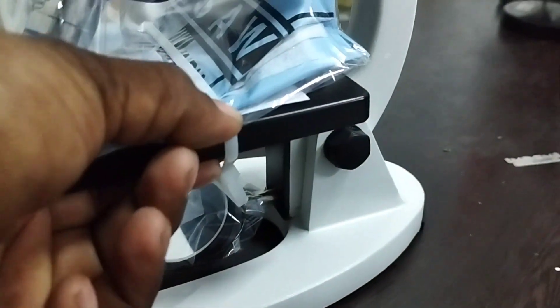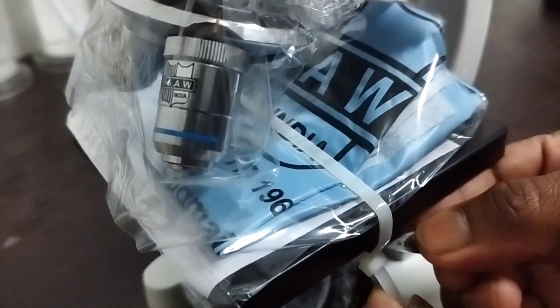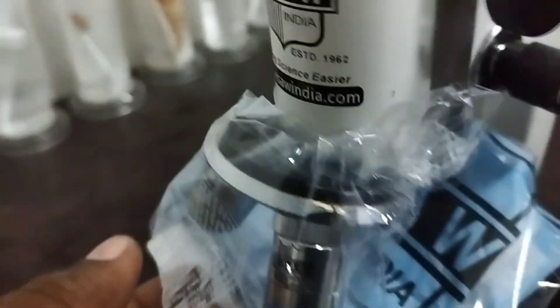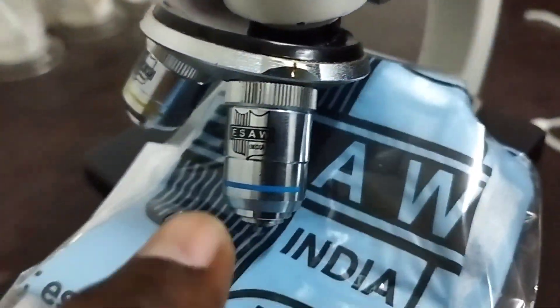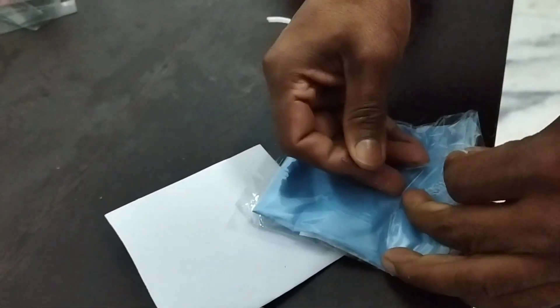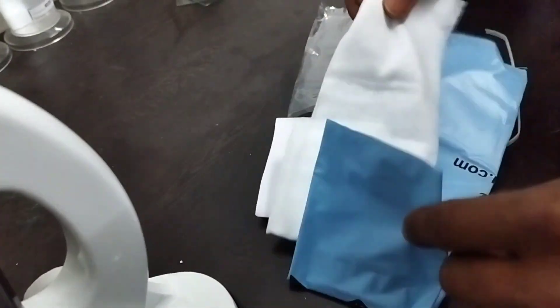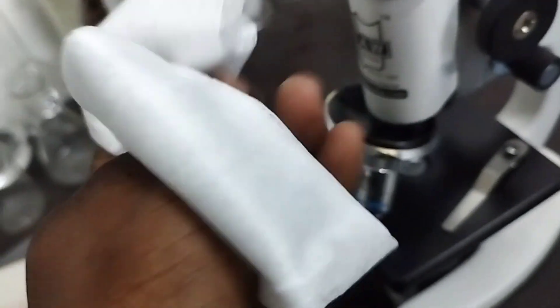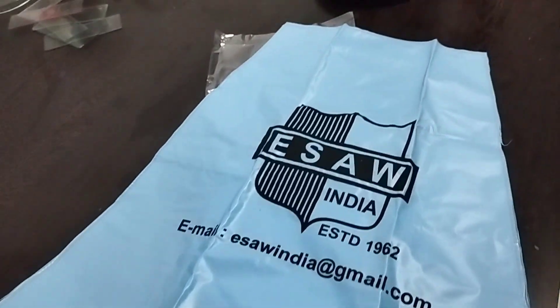You need to cut this with a blade to open the wrapping. They have provided an extra cover — I think this is the microscope cover. And this is actually a cloth by which we can clean the microscope, plus a dust cover.